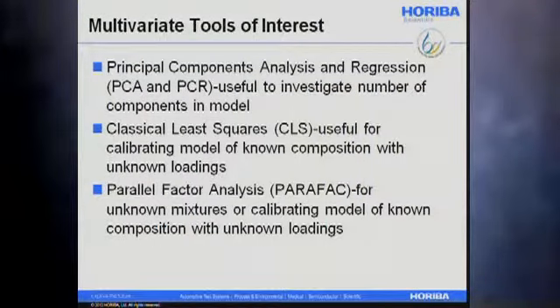Other tools of interest, of course, there's a number of ways. You don't necessarily need the full EEM in many cases, but principal component analysis and regression are very useful. Classical least squares is something that you can actually calibrate with known compositions, so you can deconvolute your mixture as a function of the linear components of the standards.